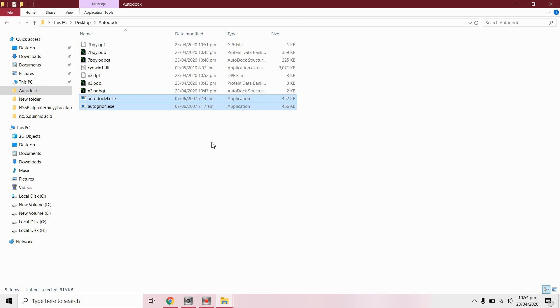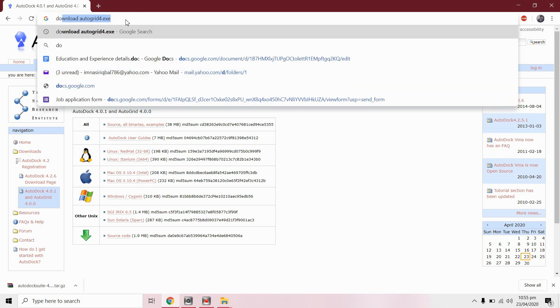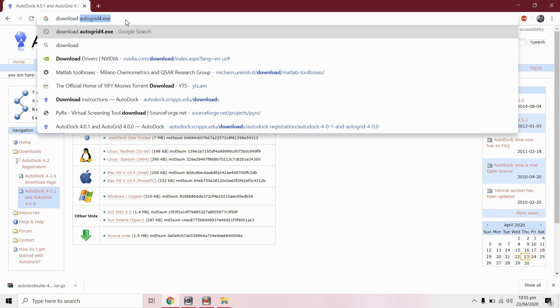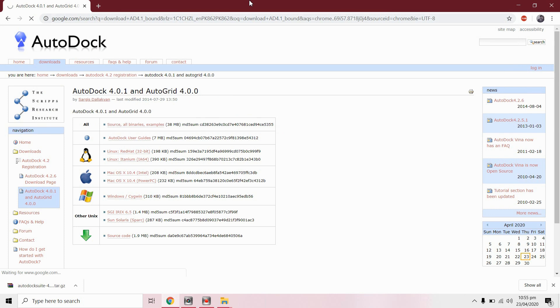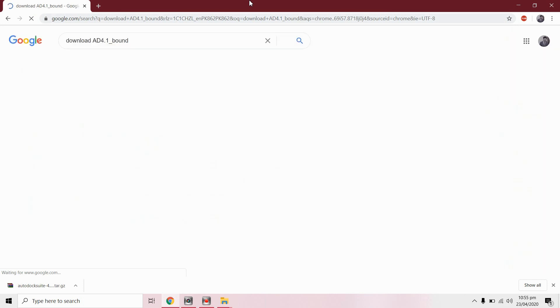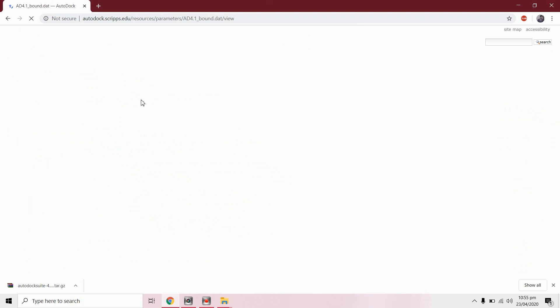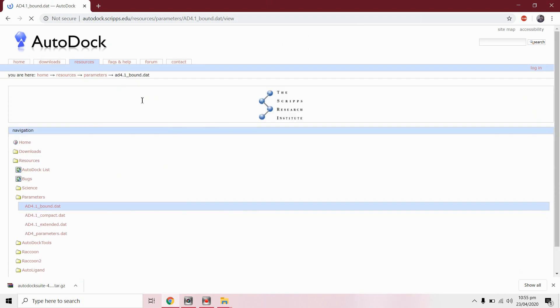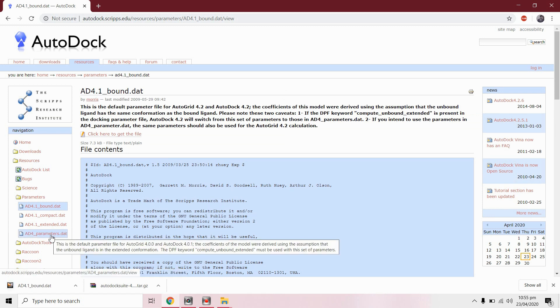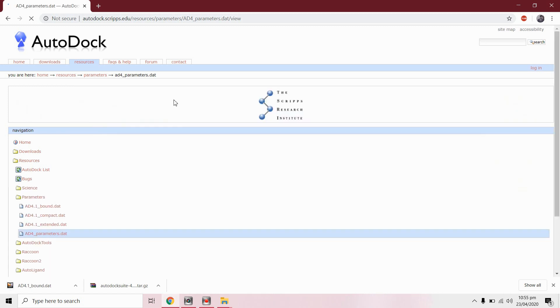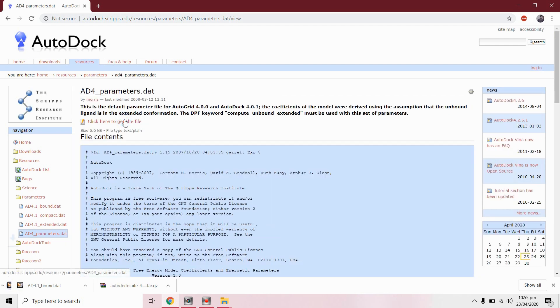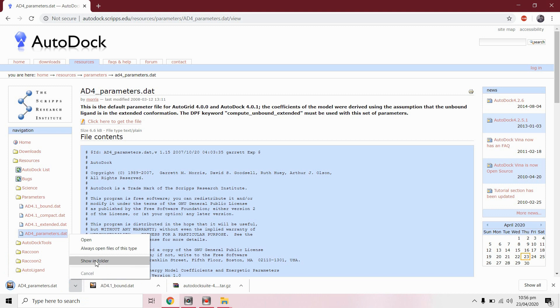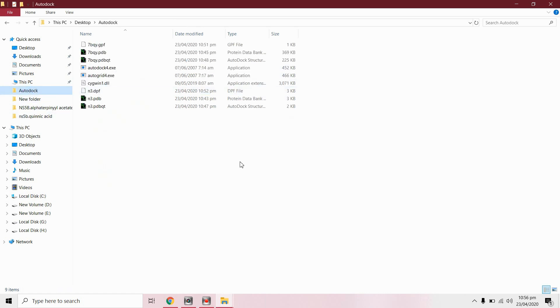We need another file which is AD 4.1 bound dot dat. Download this from here. We need another file AD 4 parameters dot dat. Download this file. Copy these and paste them in working directory.